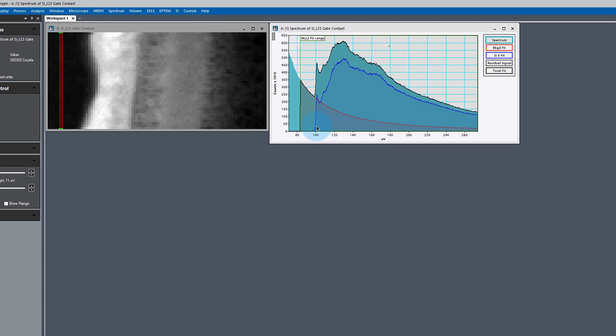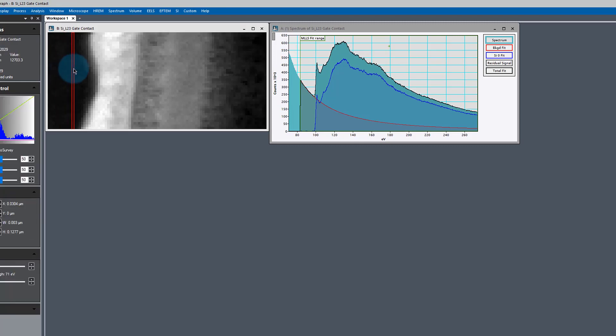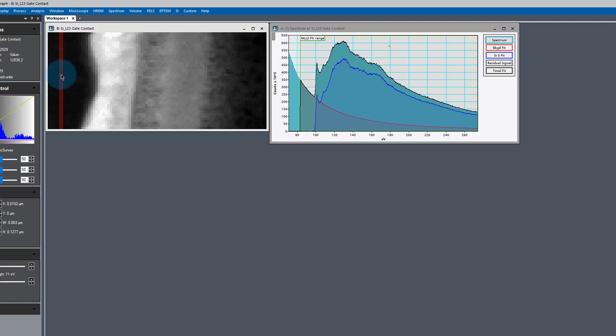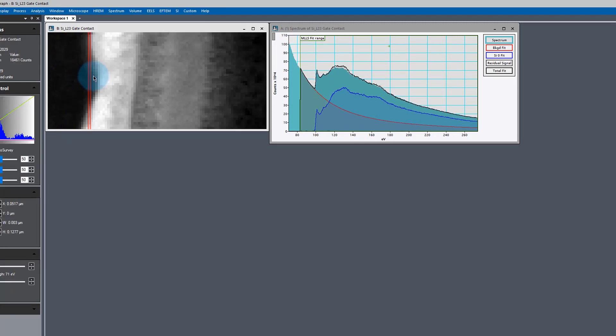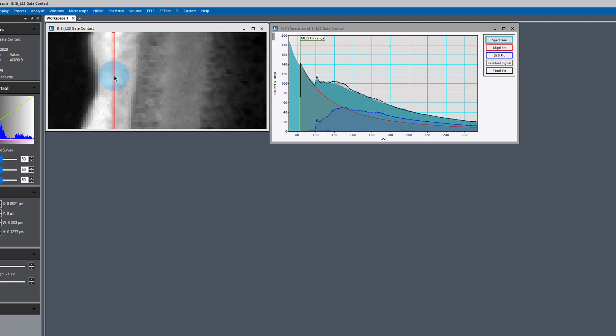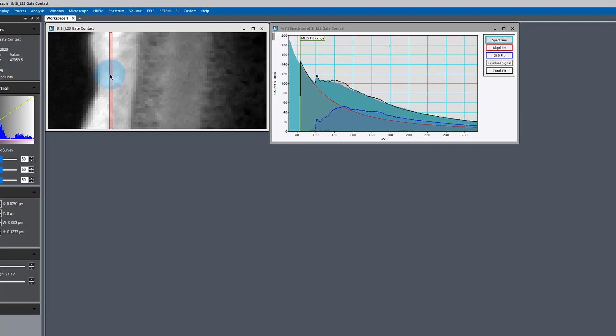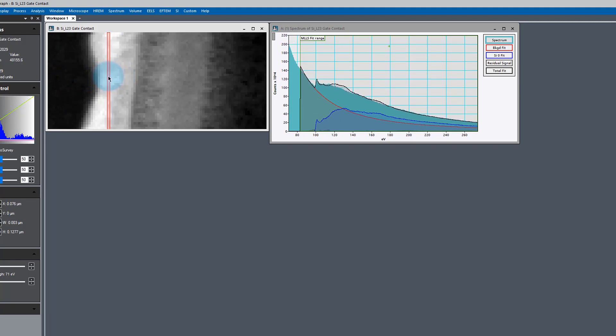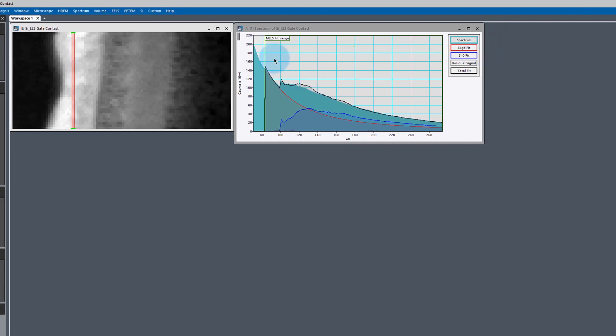We can see that we've got this total fit, which is the black line, and that fits very well to our data. Of course, because those are the references. If we move it around in this region, we see it continues to have a very good fit. As soon as we leave this region, we see that not only does our background fit poorly, but the shape of the spectrum is poor as well. This is an indication that we need another reference.